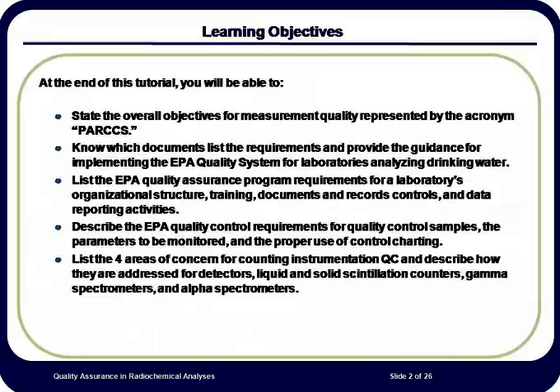Keep in mind that these are the basics for a QA/QC program and that additional requirements exist and should be identified by reviewing the documents listed herein as references.